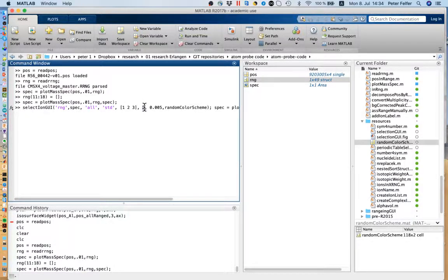This is the maximum complexity of ions you expect. So complexity of 2 means I maximally get molecular ions with 2 atoms in them, but you can have it up to however many you want. Just be aware that the computation to make the list of the possible ions explodes the larger the combinations are.